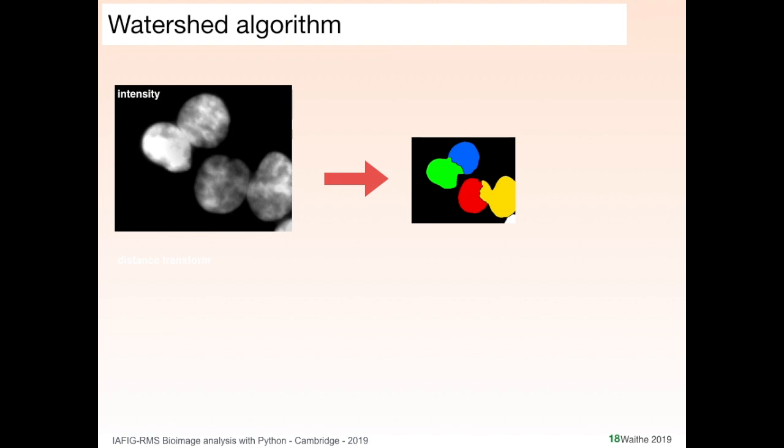So this is actually a cell where we've done the thresholding, and then within the thresholded area we've then done watershed. And what we've done is we've picked as our basin centers the brightest spots, and we've filled up the cells incrementally, and we can see we get something like this. This is not very good, but you can see how it works. Even though the cells are linked, we've managed to sort of segment them.